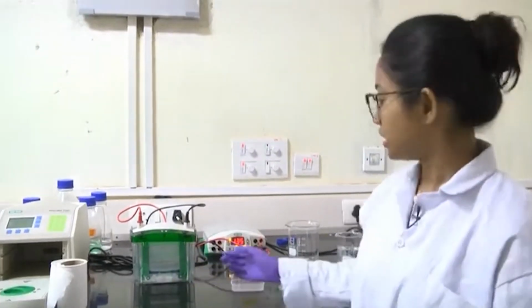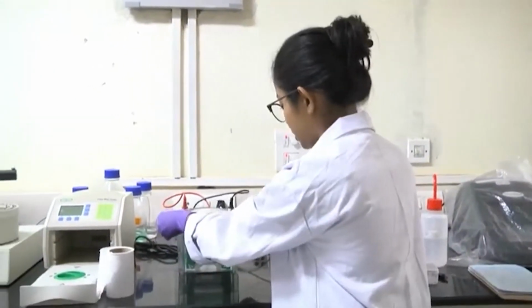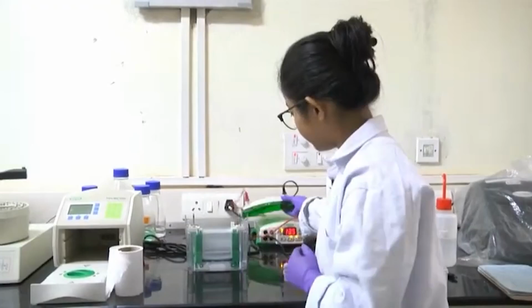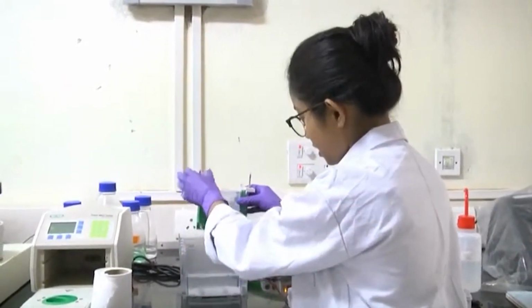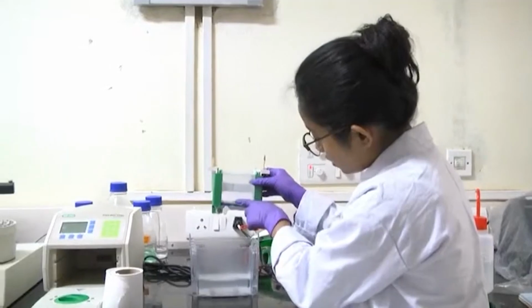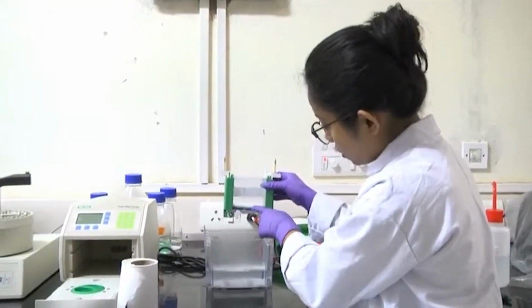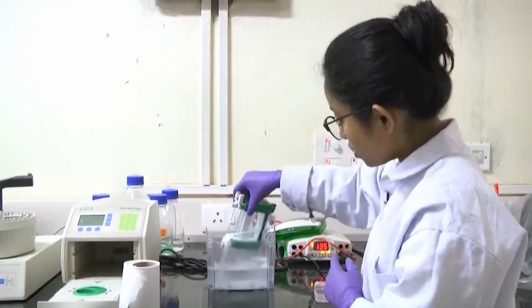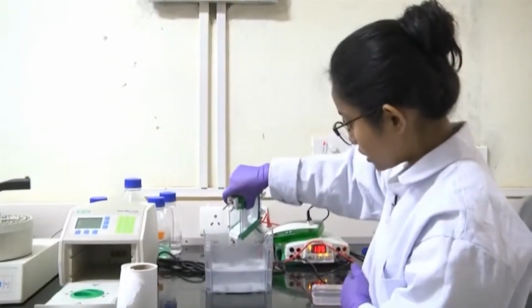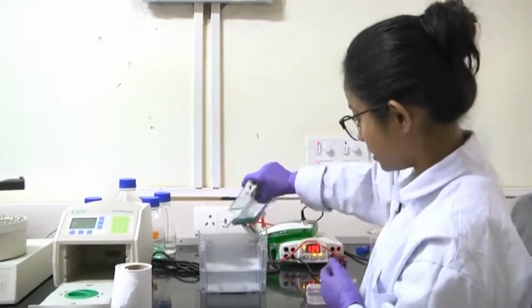Now we will take out the gel from the plate. So I am stopping the SDS-PAGE run. As you can see, the marker has been separated properly, and I know where my protein will be. So I have to stop now, and according to the marker, I will also cut the gel into small fragments, because not everywhere the protein is present.